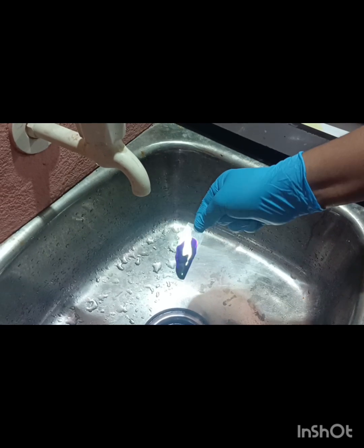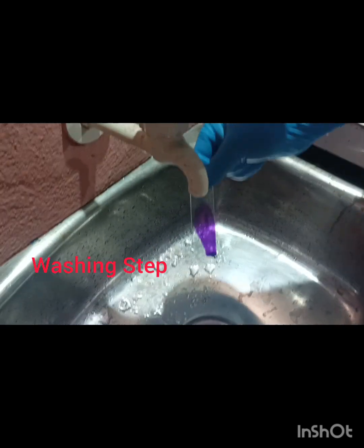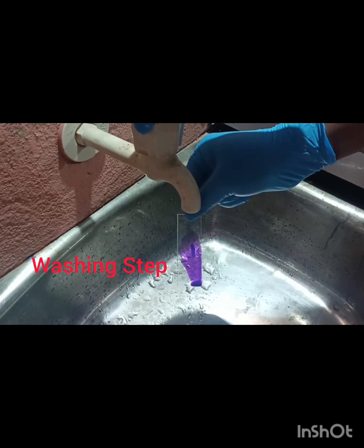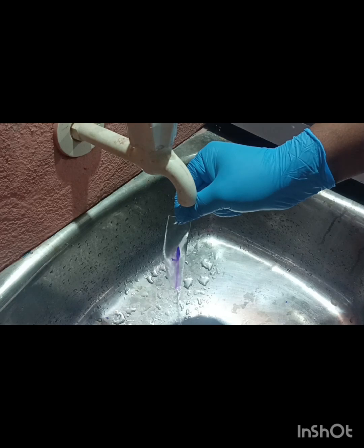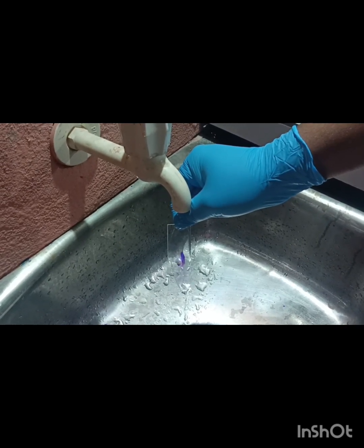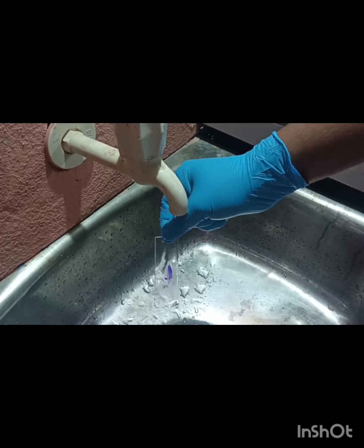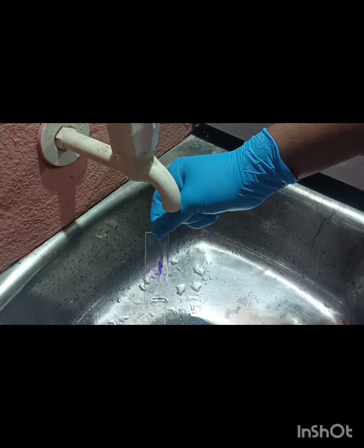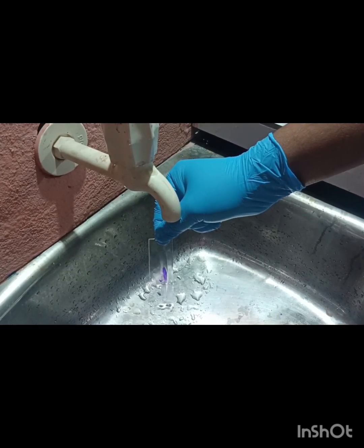After completion of 1 minute, we have to discard the crystal violet solution and wash with tap water. And we should remember that tap water should not fall directly over the smear. It should be like that. The water comes to the hand, then to the slide smear.